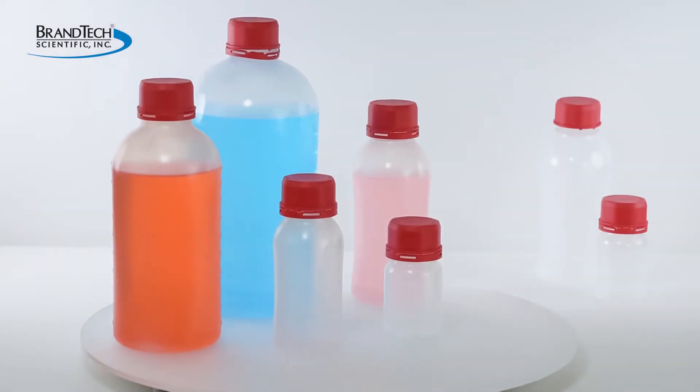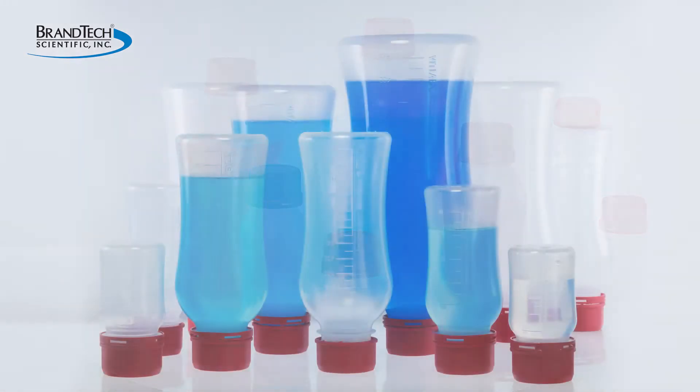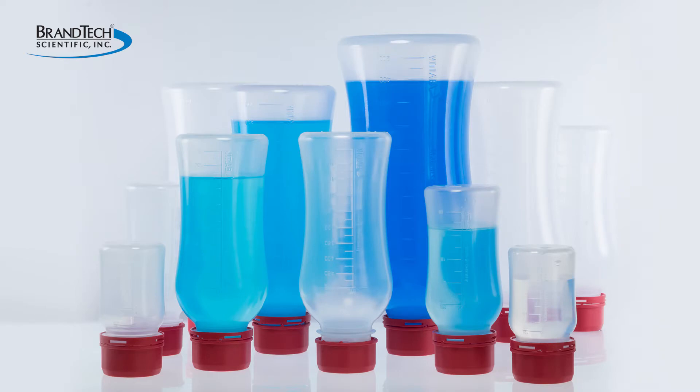Brantek Scientific is excited to introduce the all-new VitGrip laboratory bottle from VitLab. The VitGrip bottle is a high-quality, versatile bottle made for the collection and storage of liquids in the lab.